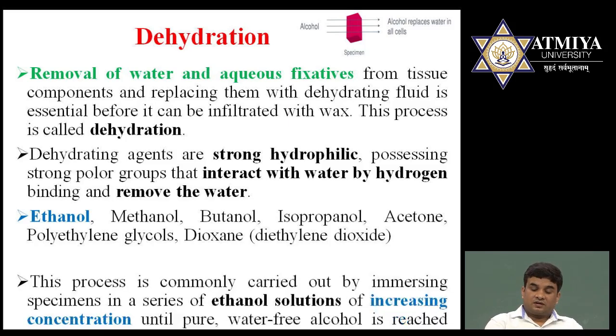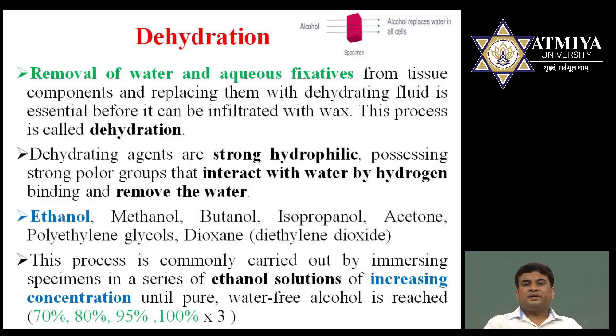The duration of the incubation depends upon the type of tissue and which type of fixative we have used. So it depends, and you need to optimize before the further steps.